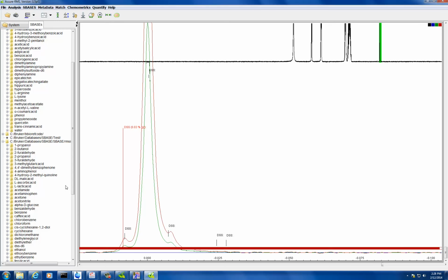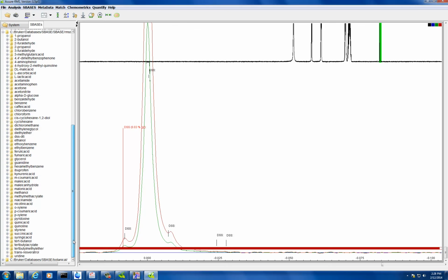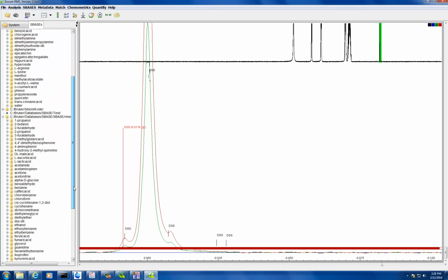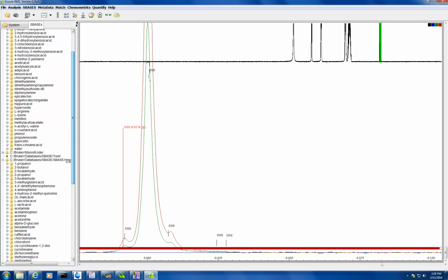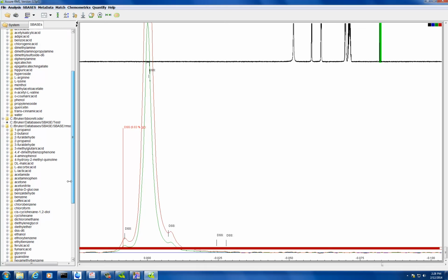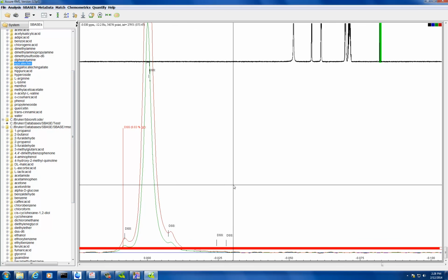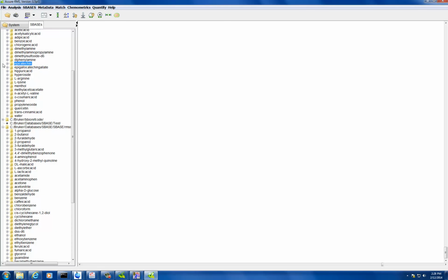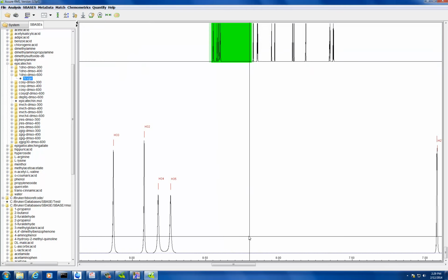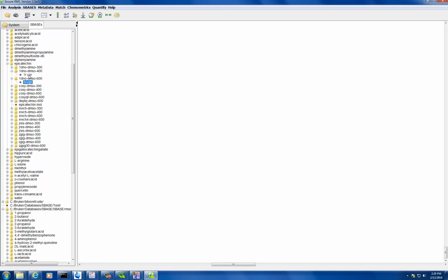So this might not have it, obviously, because this was not made for cranberries, but I see epicatechin here before in your database. Oh yeah, epicatechin. Let me just try epicatechin. And this is 400? Yeah, it's going to be around the same. Yeah, 400.